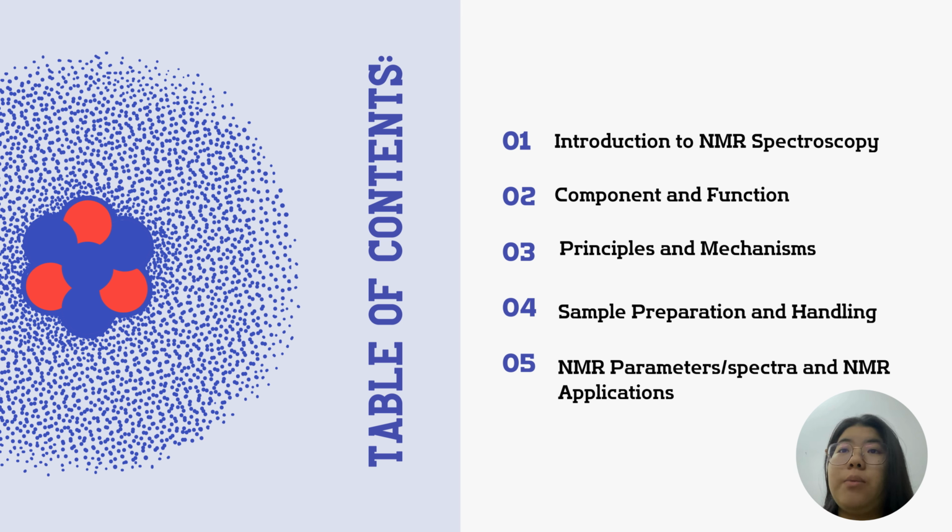And this is our table of contents. We're going to talk about the introduction to NMR spectroscopy, the components and functions, the principle and mechanism of the NMR spectrophotometer, the sample preparation and handling, and the NMR parameters and NMR applications.